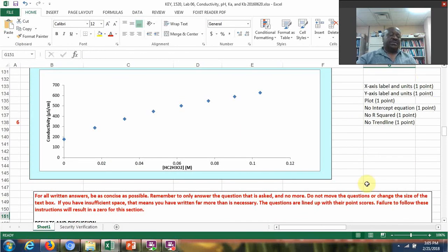You'll note in this case, and this is important that I remind you, whenever you have a weak acid, conductivity versus the concentration curves. It's not linear. Why? Because as you know, it's even in your textbook, can't quote the page, the percent ionization actually decreases with increasing concentration.